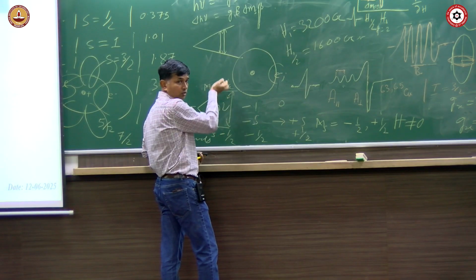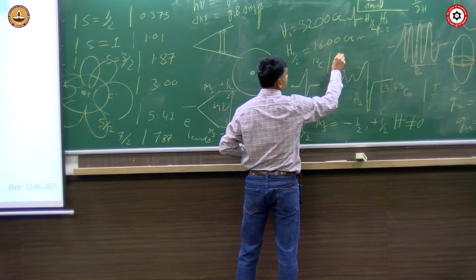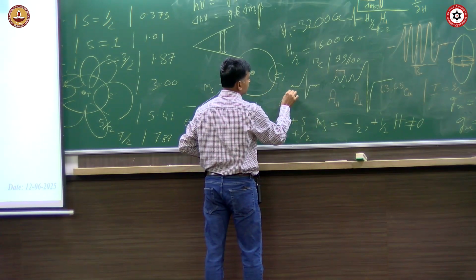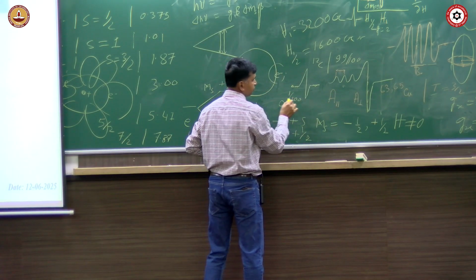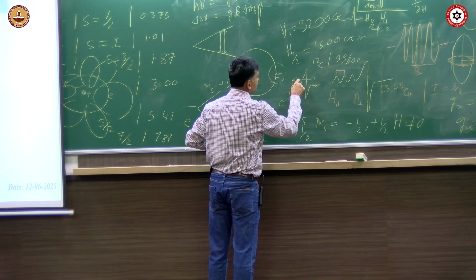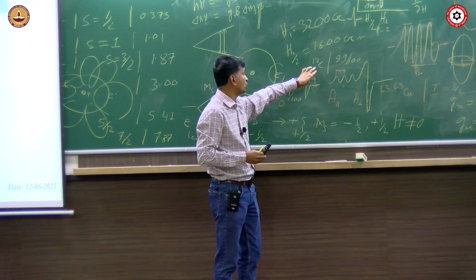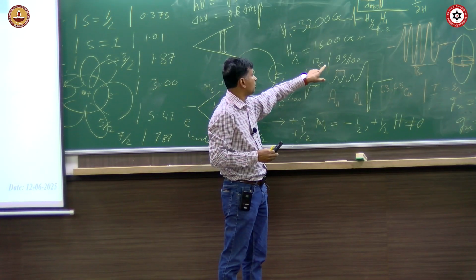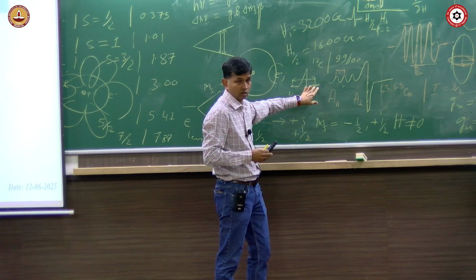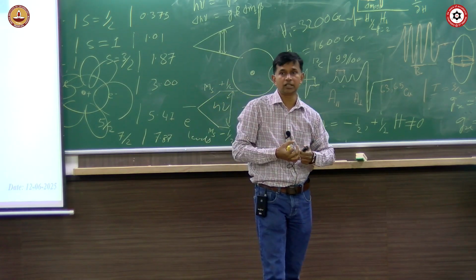Okay, normal electronic transition, where the electron is sitting on the 12C, and their number is nearly 99 per 100. And this satellite feature is 1 per 100. The difference from here to here is the coupling constant of the electron with the nucleus of the carbon. For carbon 12 we do not see it because there is no nuclear spin. For carbon 13 you can see it because it is spin active. So then you can measure it, and how strongly it is coupled.